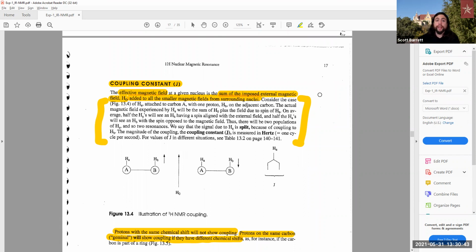So integration is something that we perform using the machines already, or the software that we can integrate in. But reverse integration, looking at an NMR and seeing the integration, can tell you information, so that you can piece together the puzzle for unknown compounds. Or if you have a compound you made, you have a theory that it's going to be at this location with this many hydrogens, you run your NMR, and now you can nicely integrate it and confirm what you are taking, your unknown sample or your predicted sample that you created in lab, up to the NMR machine.